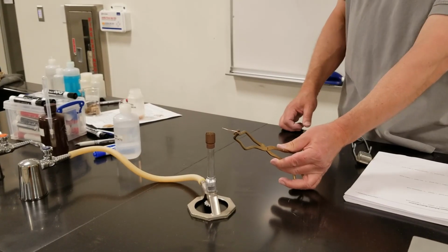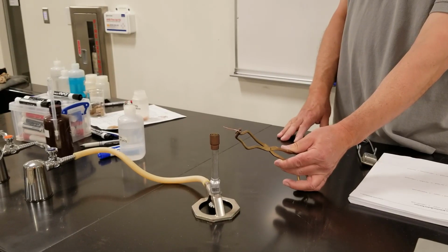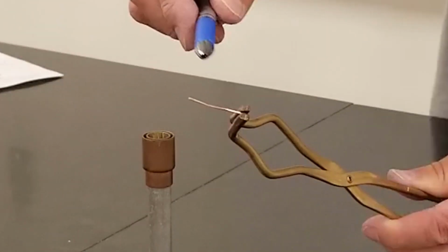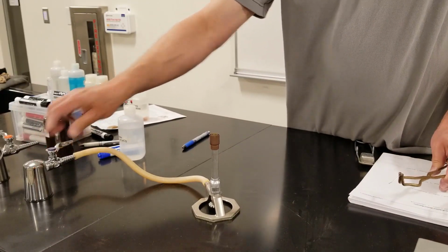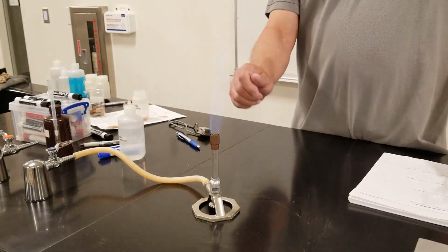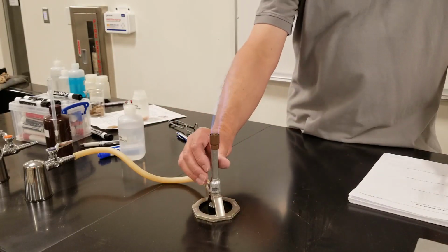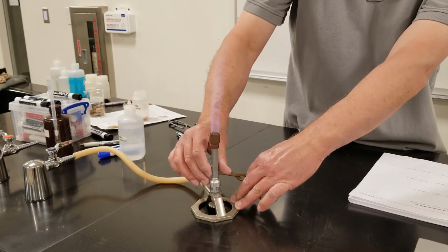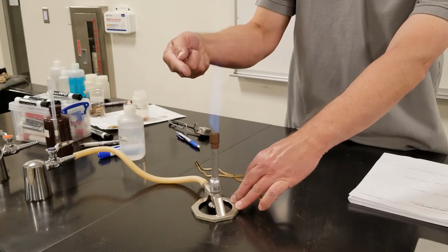Okay guys, we're on page 99 at the very top. It wants us to react copper metal with oxygen in the air. The copper metal is this shiny brown piece of metal, and to get this to work we need a good hot flame from our Bunsen burner. When we first turn the Bunsen burner on, the flame's not that hot. If we open up these little windows at the base, we let more and more air come in. More air coming in here gives you a hotter flame up here.